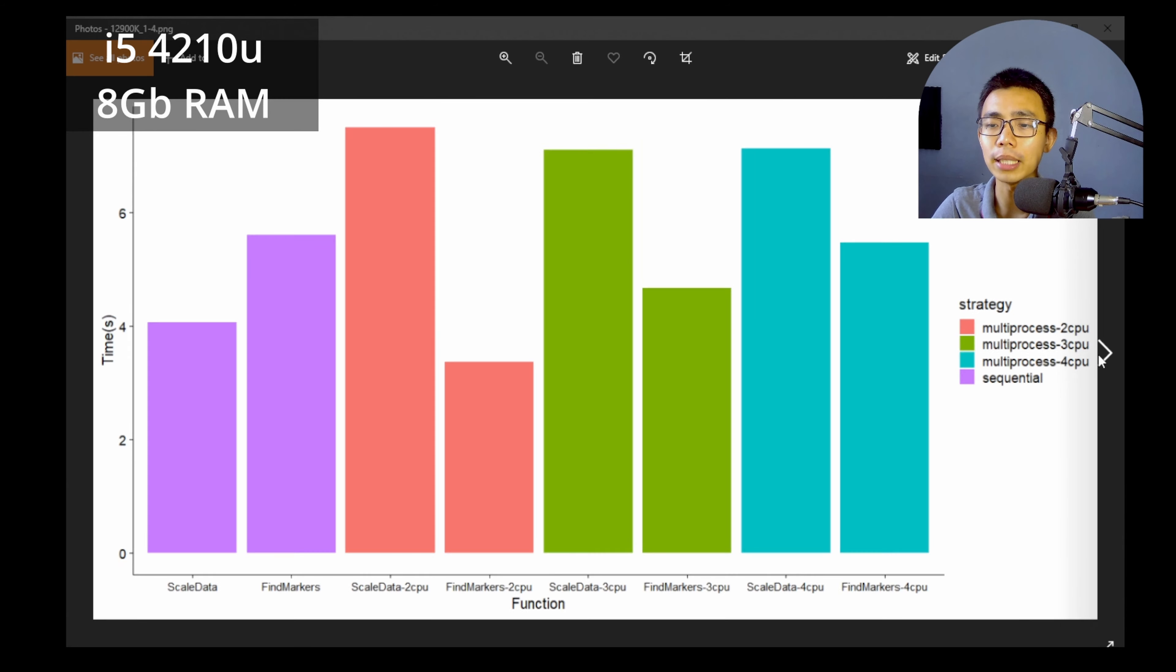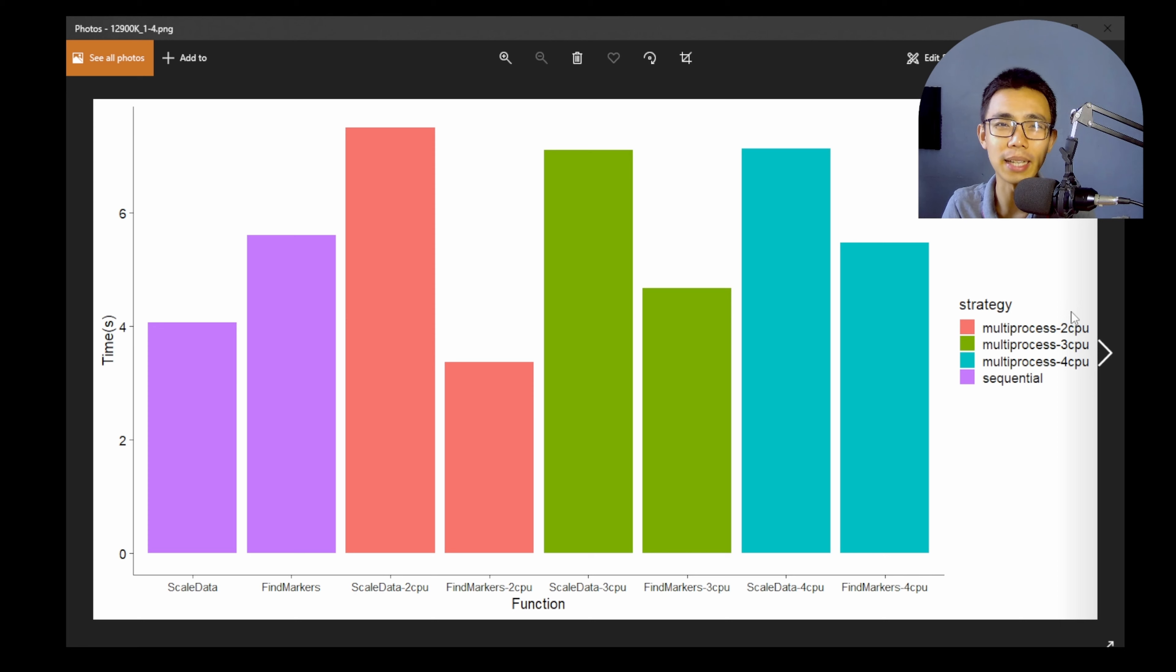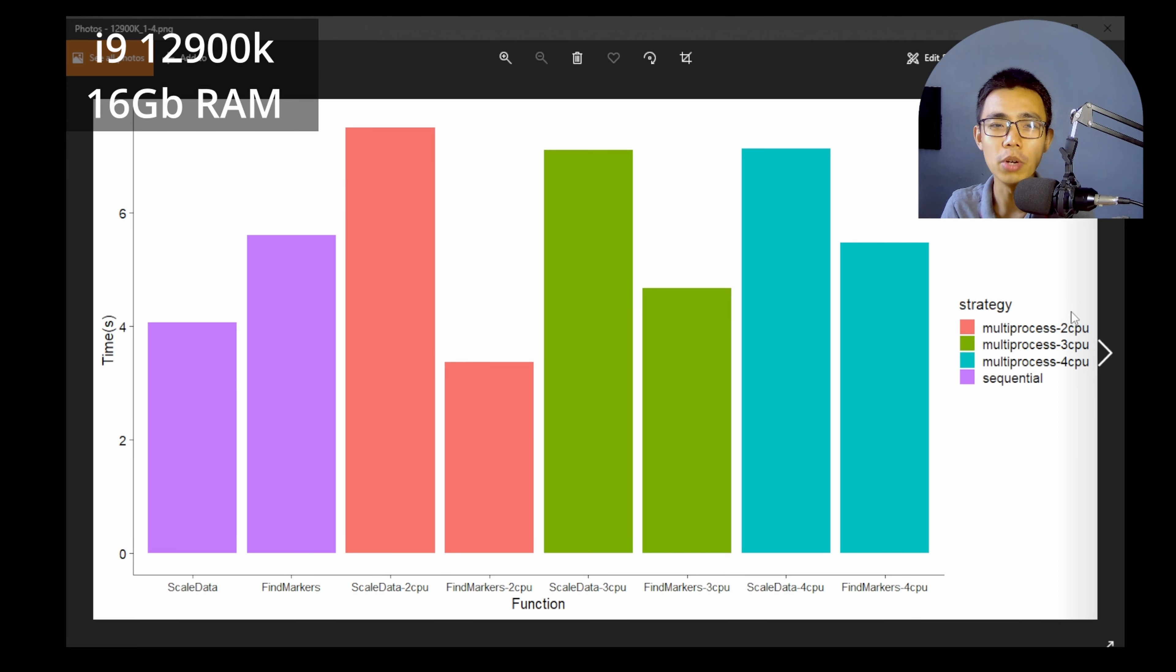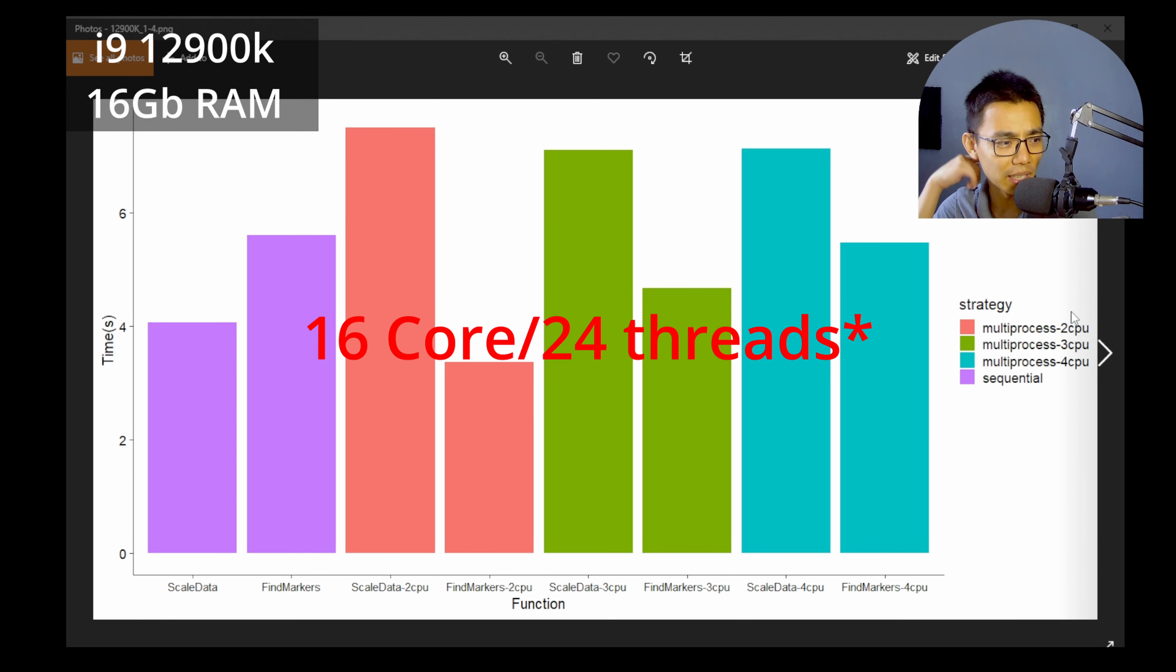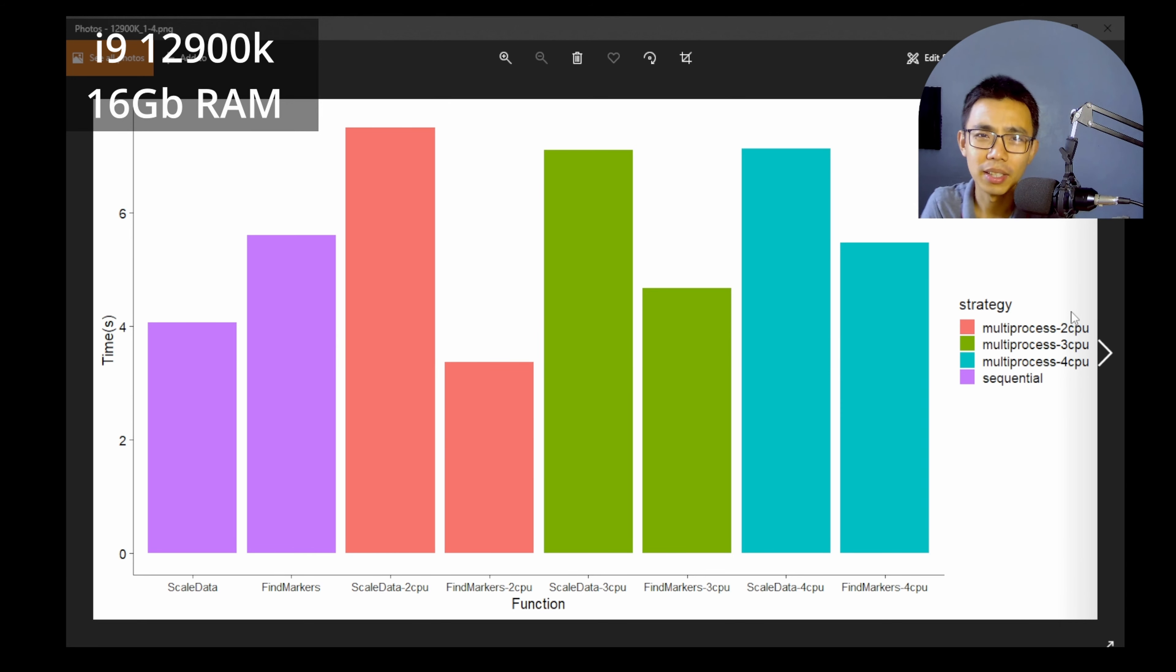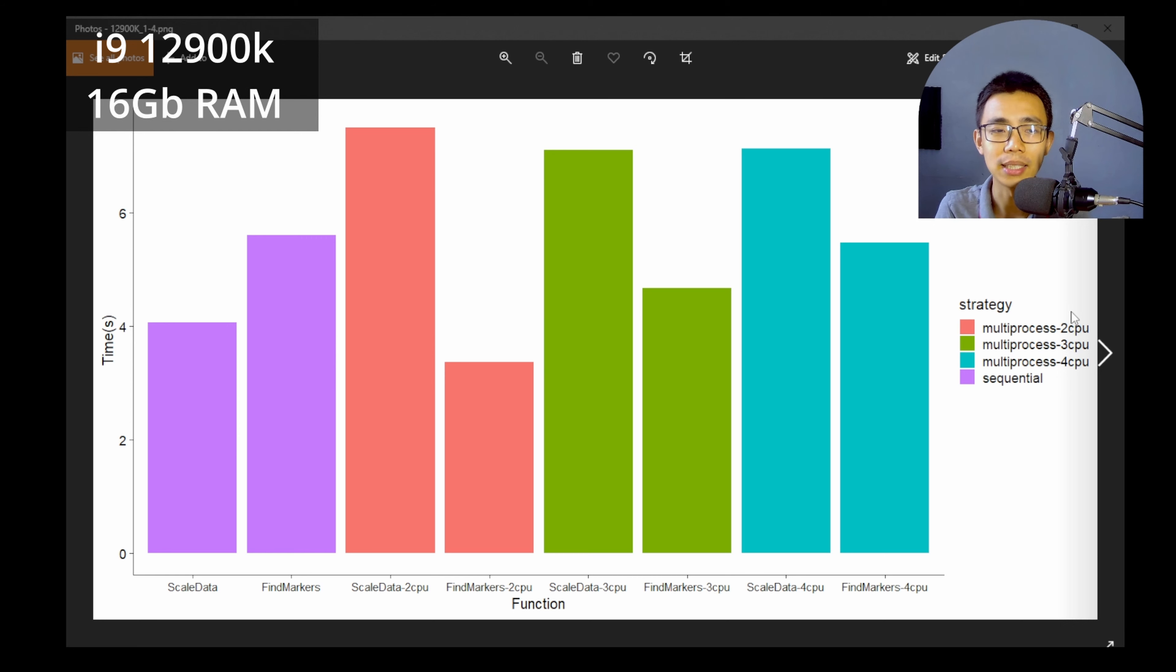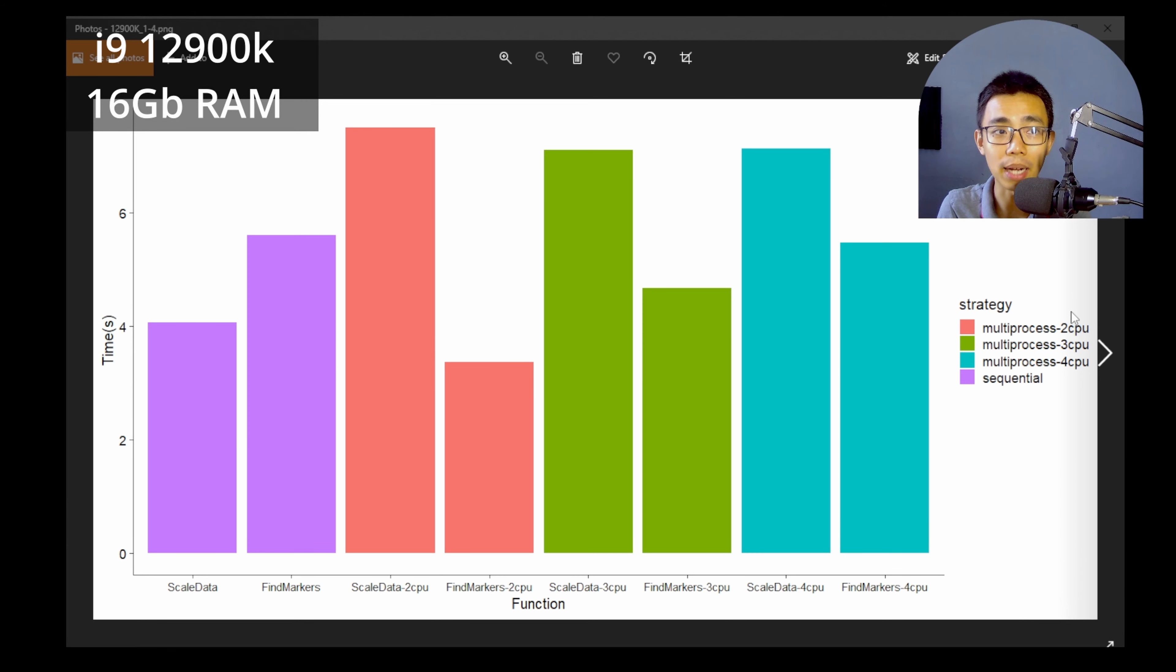So I also did another run with, you know, I was thinking all this thing that I'm running is too old. So I'm running here a 12900K, which is I believe a 12 core CPU 24 thread or something 16 core CPU 24 threads, something like that. And you can see that scale data still suffers from the same problem while find markers has almost exactly the same trend.